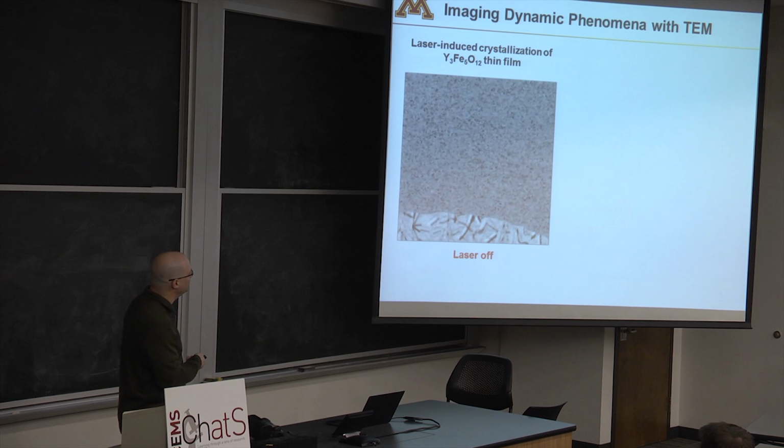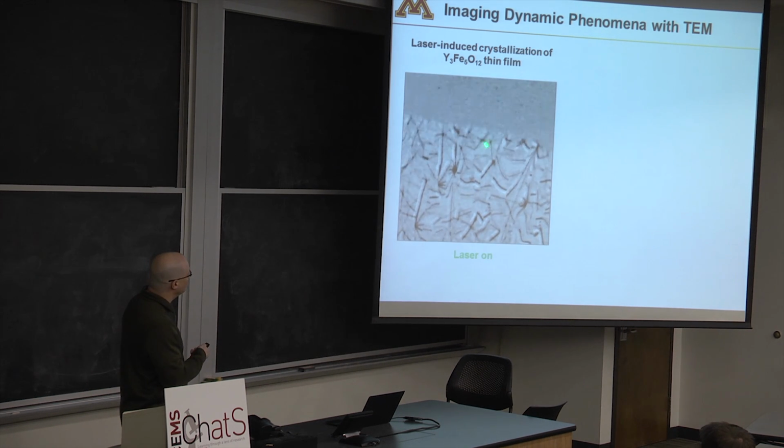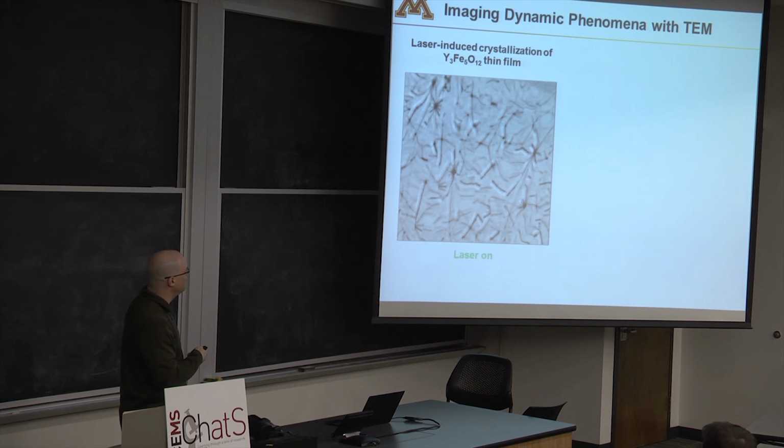So the laser is off. That's how we heat this. We're going to turn the laser on now, and you can see this thing crystallize, right? All that glass goes away. It turns into this big single crystal chunk inside the TEM, okay? And so we just watched that, would you agree, in real time? Would you agree to that? Yeah, it just happened in real time, right? Okay, so that's great. That's exciting.